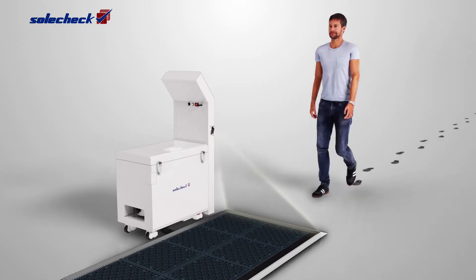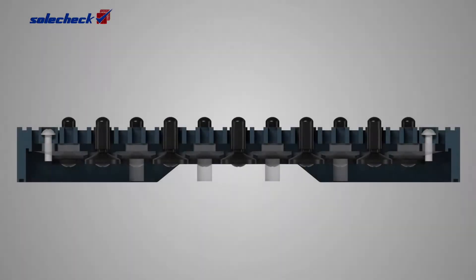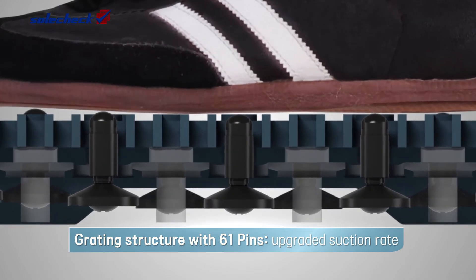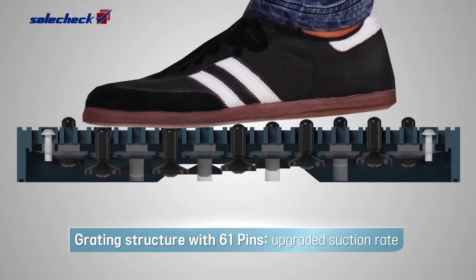Just walk a few steps on the SolCheck and it starts with auto-sensor detection. The pins stepped on are open, and soil, dust, and fine dust from the shoe sole are vacuumed strongly and instantly.